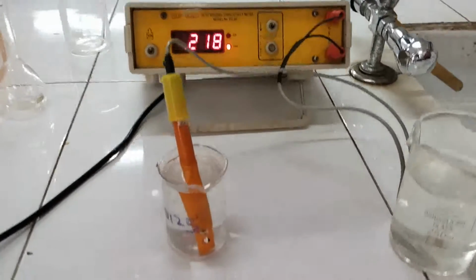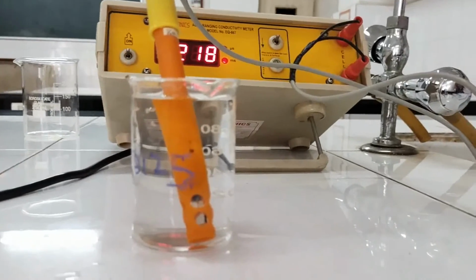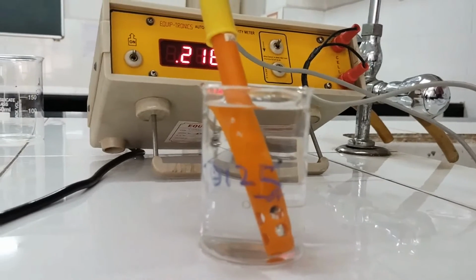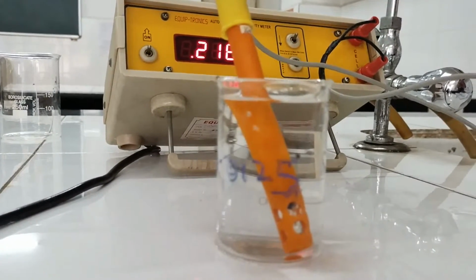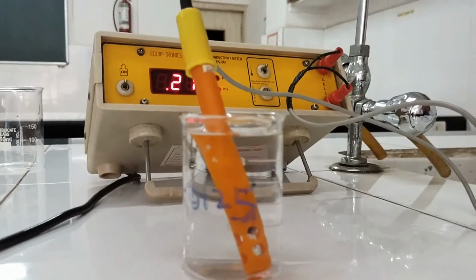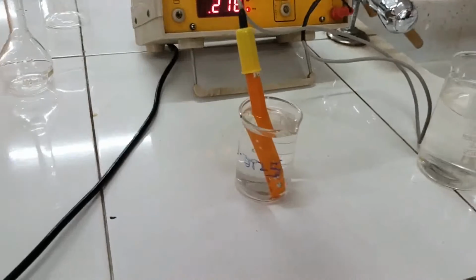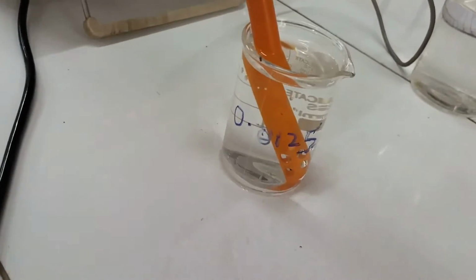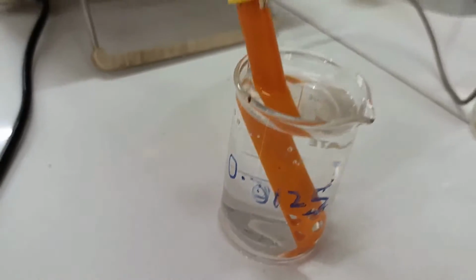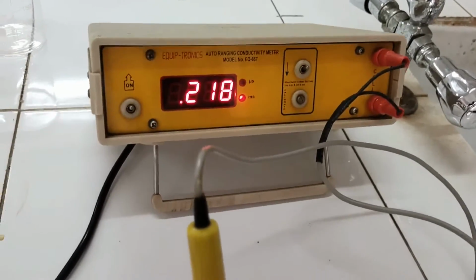It's very simple. Only one thing which you need to remember is, as far as possible, whenever we are preparing different concentration solutions, always start with the lowest concentration. So every now and then there is no requirement of washing the electrode. So we go into the lowest concentration, which you can see is 0.0125, and you can check out the value also. Simple it is. Just insert the electrode.